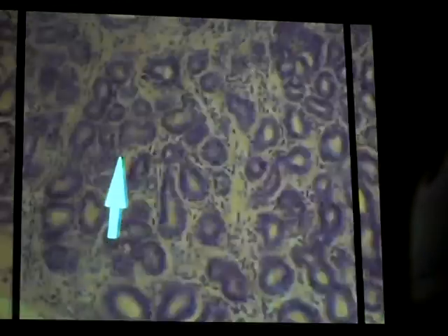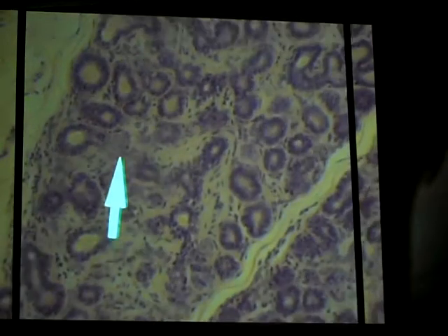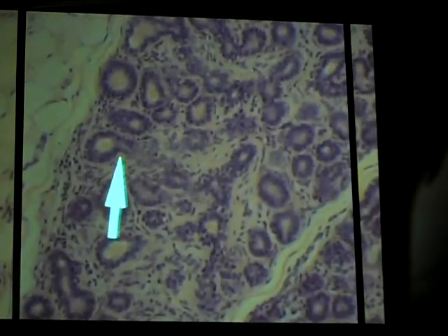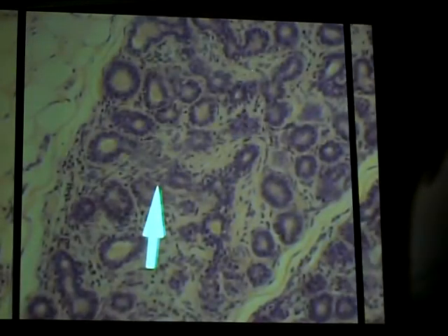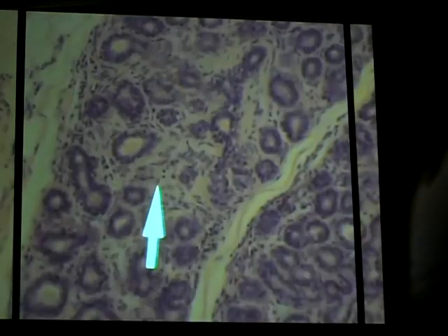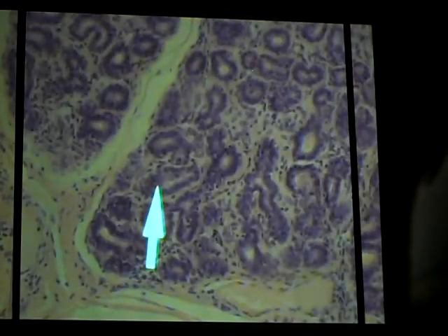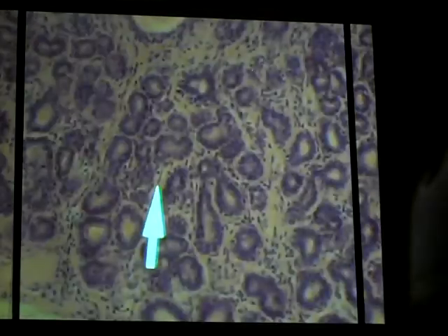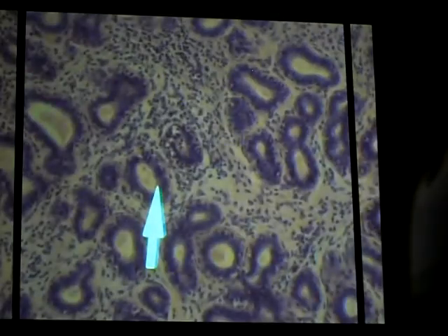These are pretty active, producing milk inside the mammary glands, so you're going to see a little bit more of a lumen. That's one of the few places that you'll find your apocrine sweat glands. Most of the ones that we see, the scalp, the thick skin, are going to be eccrine sweat glands.